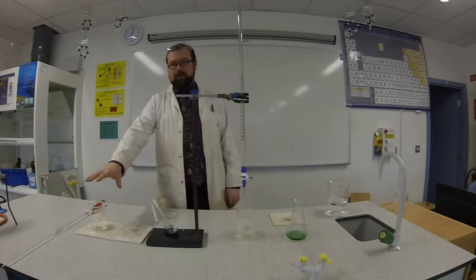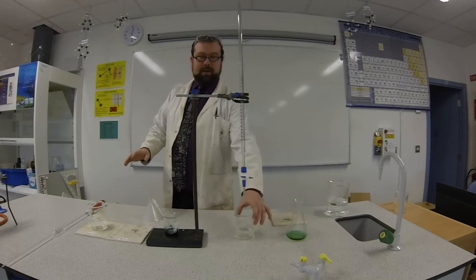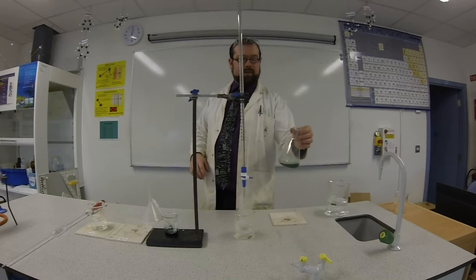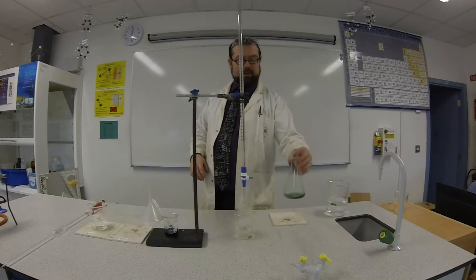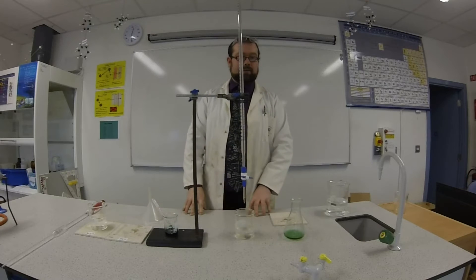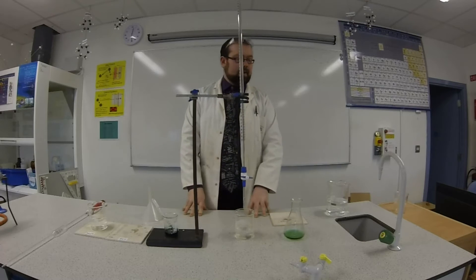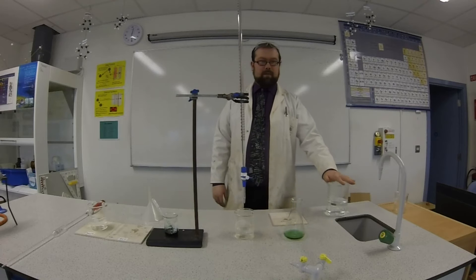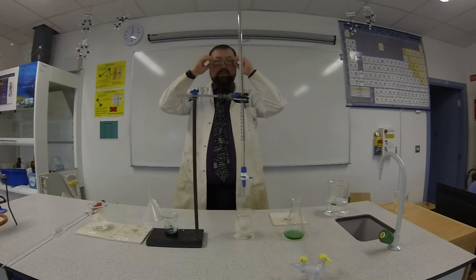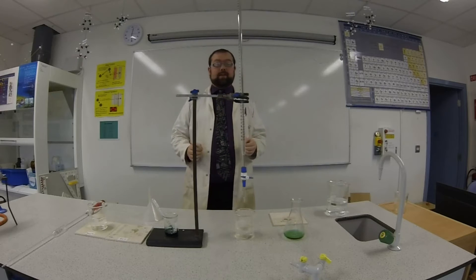So what we are going to need is of course sodium hydroxide. Here I have my hydrochloric acid. I have a conical flask. In here I have already put 25 centimetres cubed of my sodium hydroxide as well as a little bit of methyl orange. It's green in base and it's going to turn red if we get an acid. I've also got a place to put all my waste liquid, a foam mat, and most importantly I've got my goggles on because I need my eyes later to see the results.